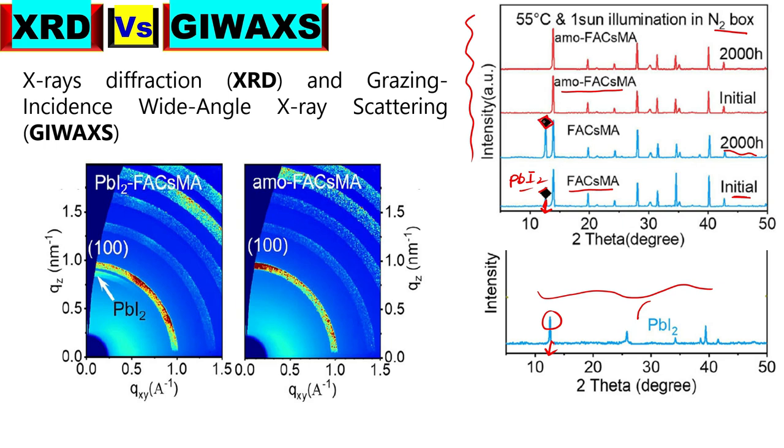This means that the material is degrading with time, and the amount of the lead diiodide phase is increasing. How do we know? We know from this peak intensity. This is the unwanted peak. Now, when the surface is modified with another material, we can see that the lead diiodide, which is there by default, disappears because of this additional modifier.